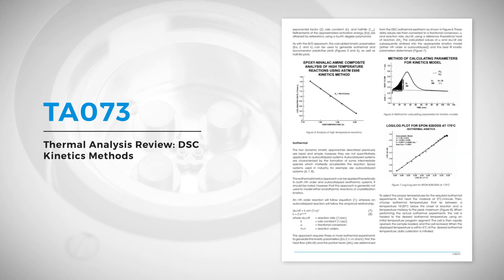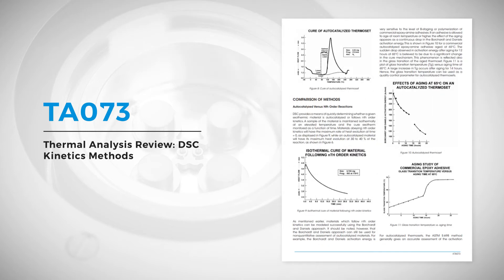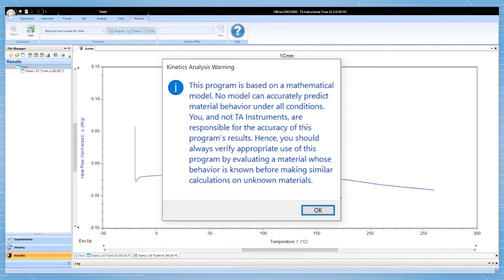Selecting the correct model for your kinetic process is a crucial first step to generating good data. The workflow of analyzing kinetics data in TRIOS starts by selecting the Kinetics tab. This tab will be activated when the Kinetics product key has been input into TRIOS.